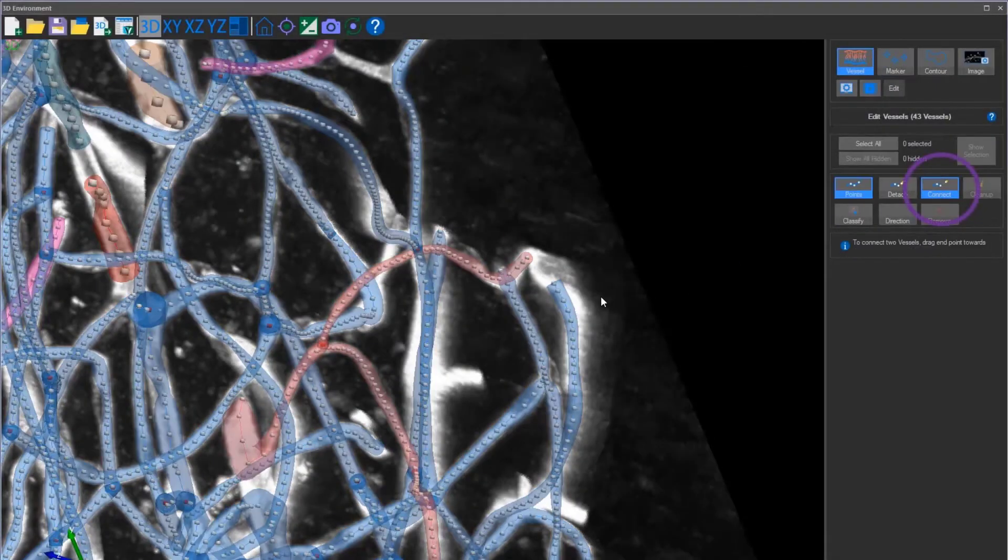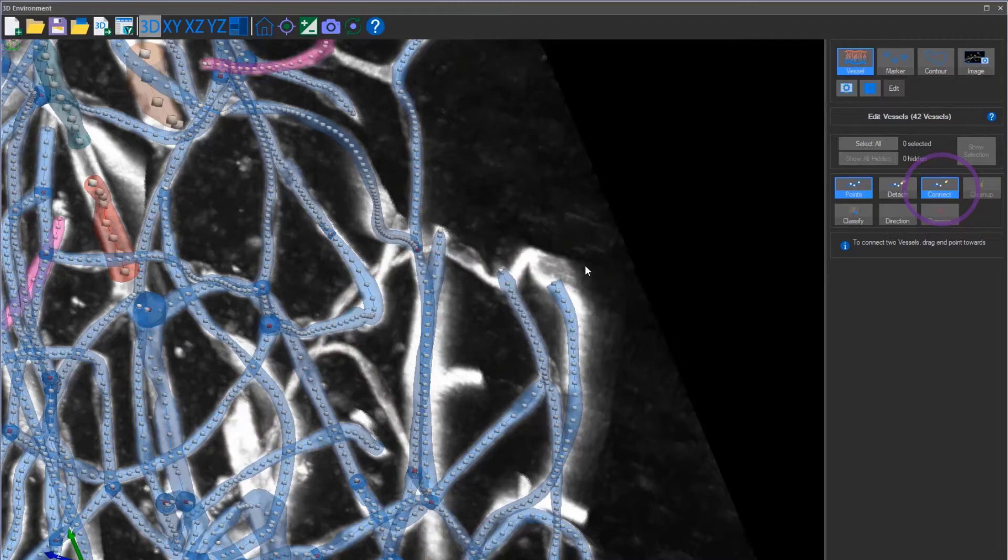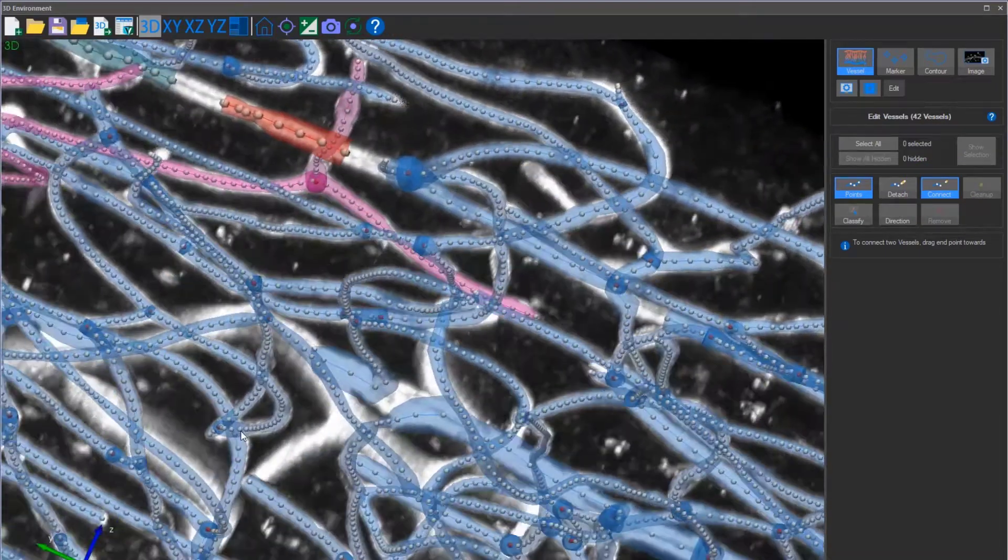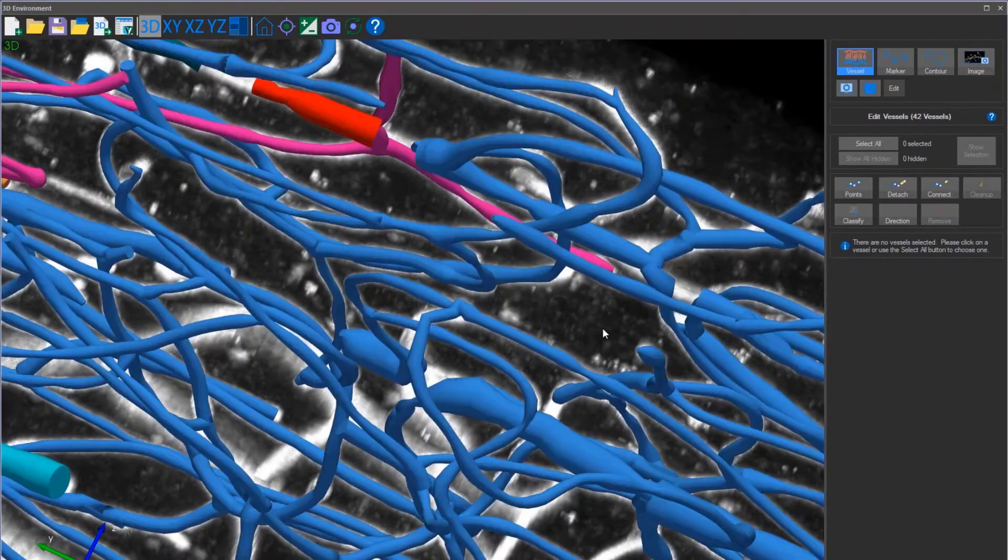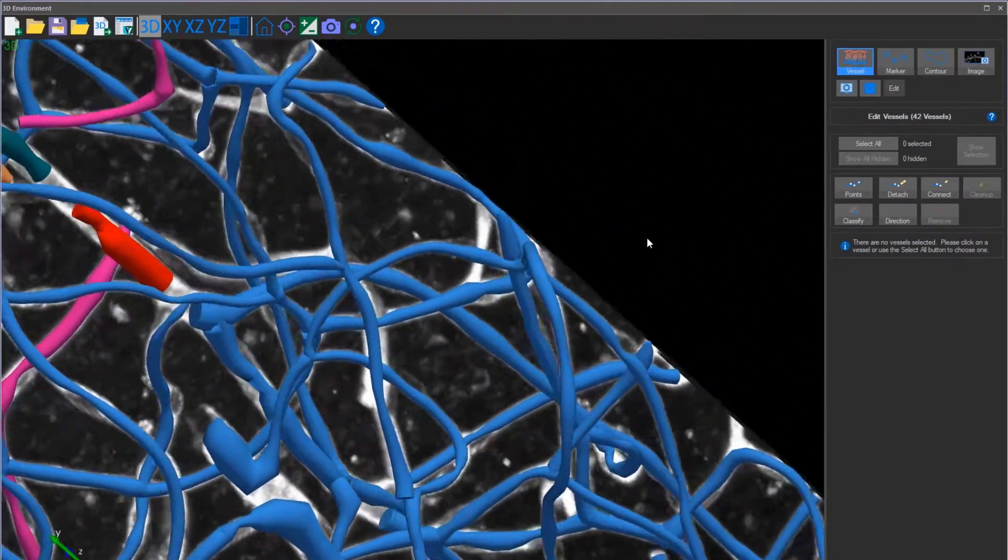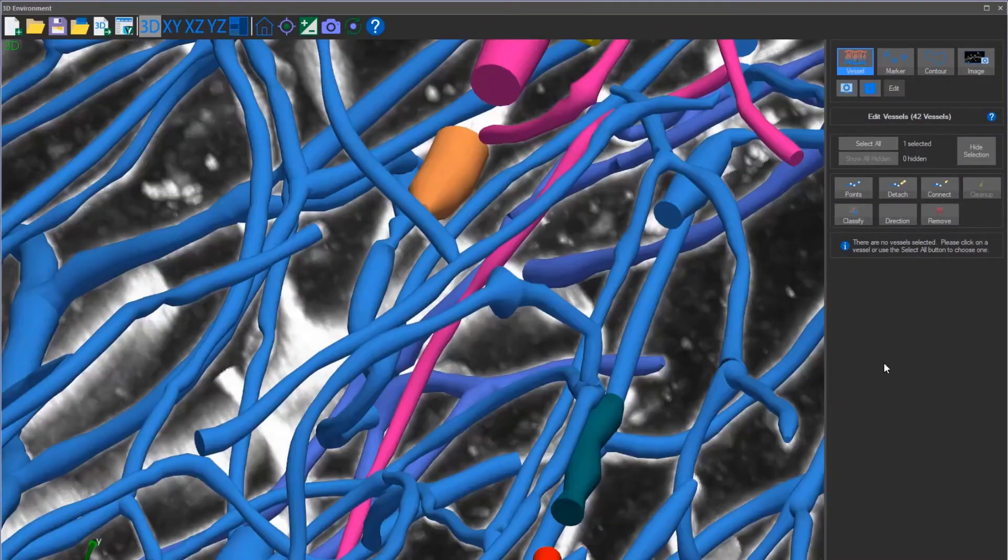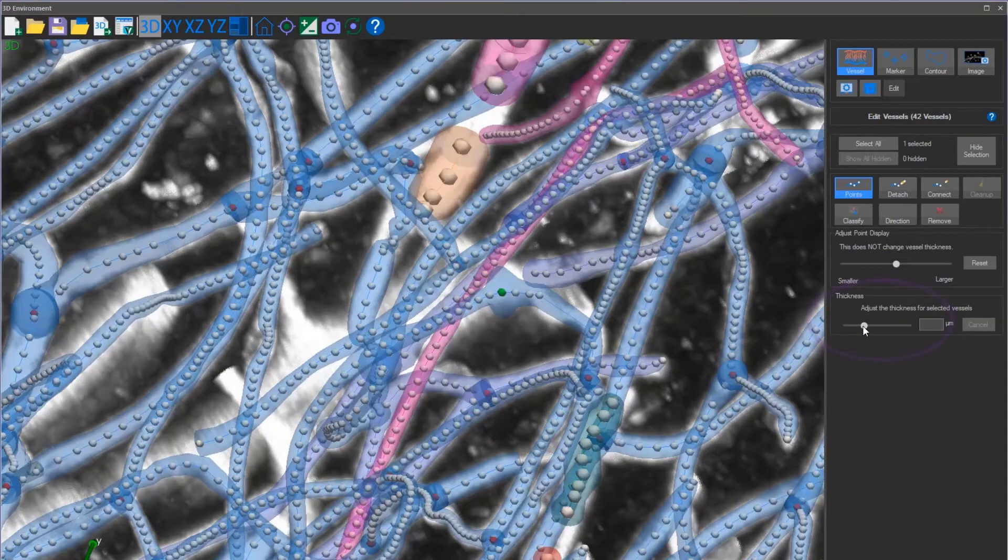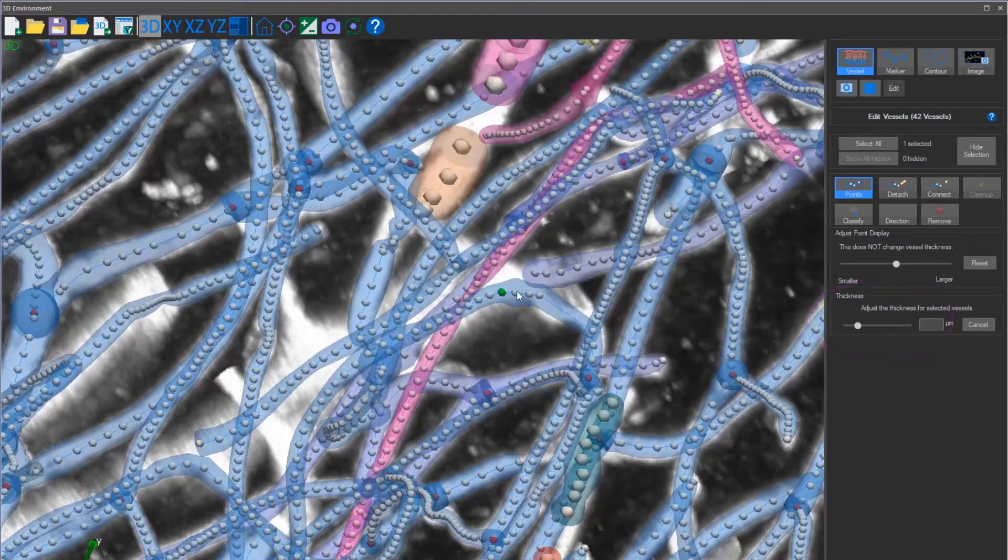Veselucida 360's connect tool makes editing simple and easy. Zoom in and identify the vessel segments that aren't connected. A few simple clicks will create a uniform color representing a single connected vessel segment. While in the editing function, clean up the 3D reconstruction by moving points and adjusting the thickness of the vessels making the reconstruction more accurate.